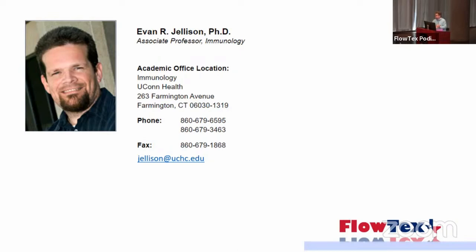Super important, nascent field. That's why flow cytometry and getting the tools and the equipment to be able to look at these extracellular vesicles is going to be absolutely critical going forward. Yeah. Thank you. Hopefully that's enough.